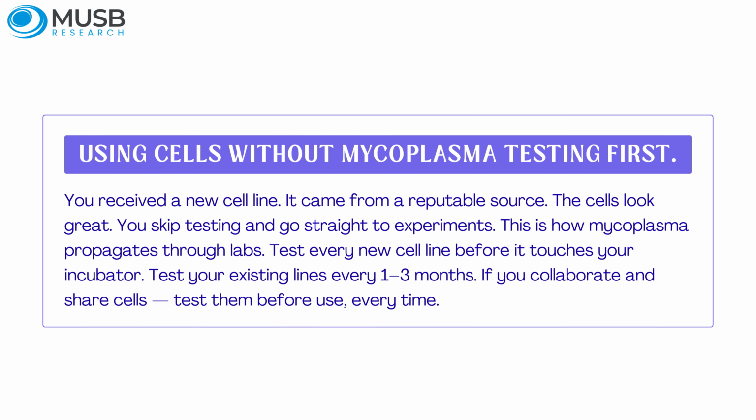3. Using cells without mycoplasma testing first. You received a new cell line. It came from a reputable source. The cells look great, you skip testing and go straight to experiments. This is how mycoplasma propagates through labs. Test every new cell line before it touches your incubator. Test your existing lines every 1 to 3 months. If you collaborate and share cells, test them before use, every time.